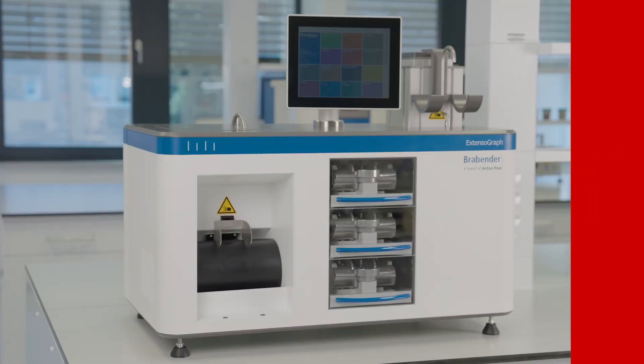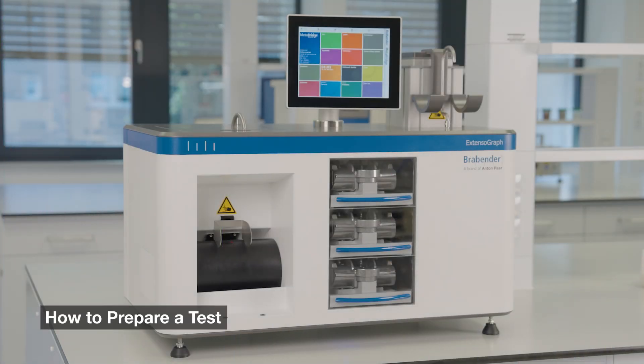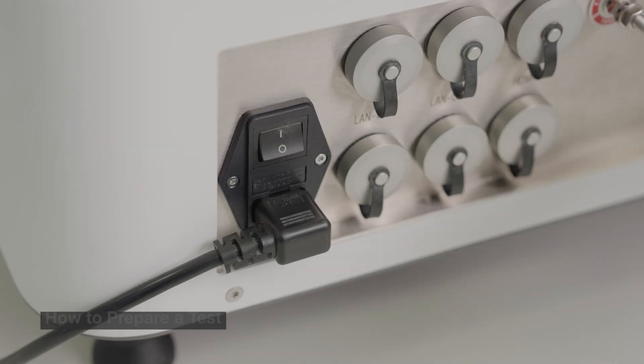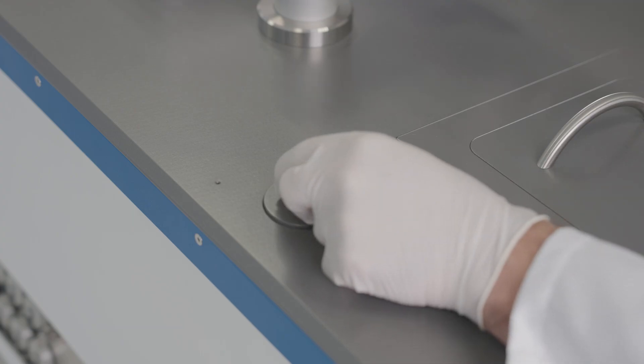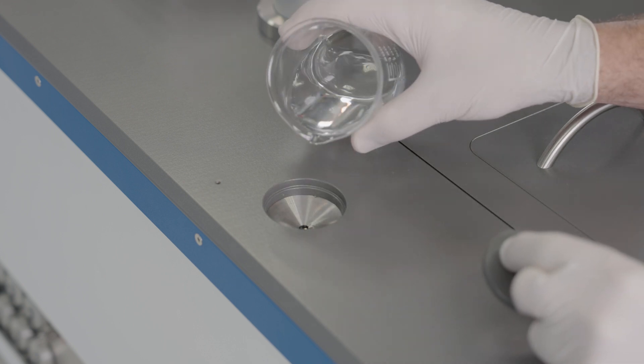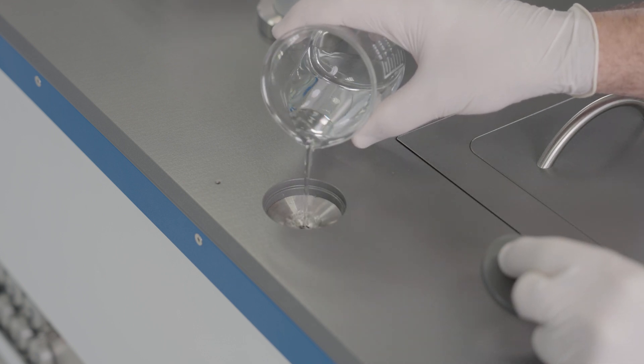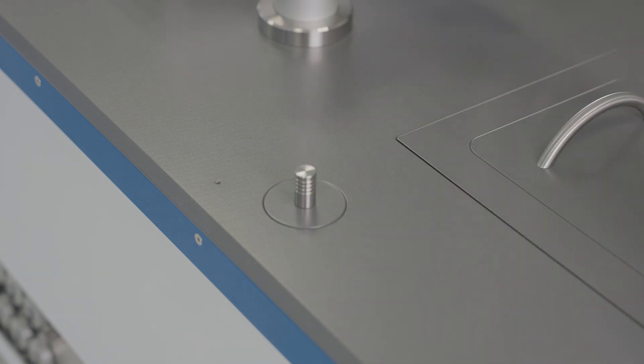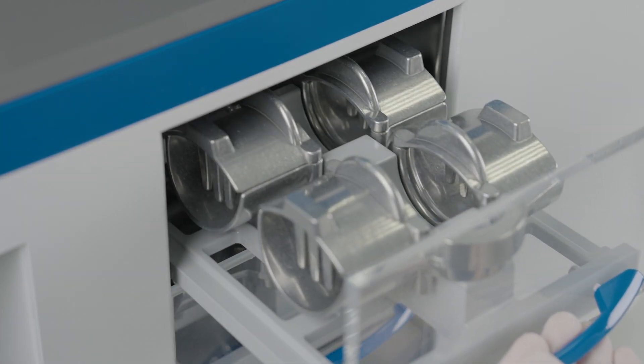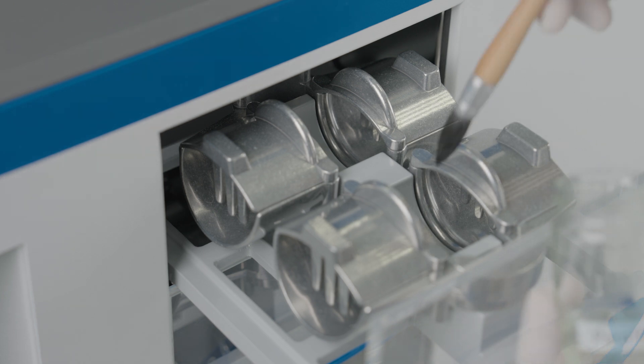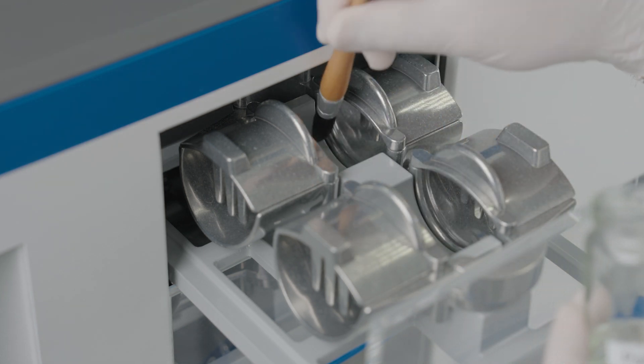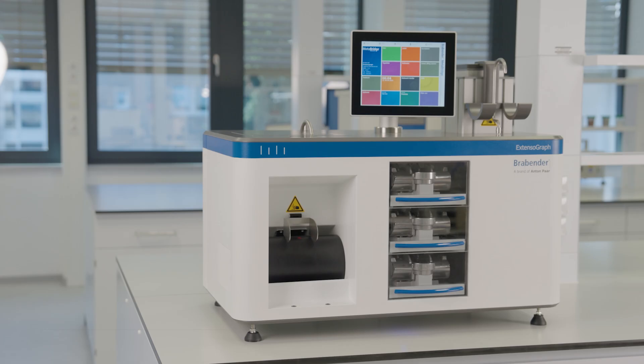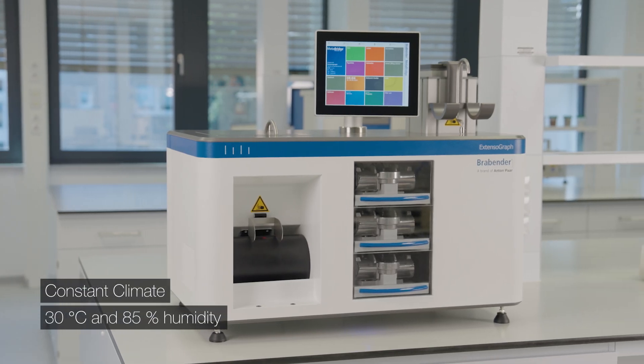In this quick start guide, we will show you how to set up and use the extensograph. Switch on the device and fill the water reservoir with 200 milliliters of water, then remount the lid. Open the tray and grease the tray supports with a thin film of paraffin oil daily to prevent dough from sticking. Close the tray and allow it to stand for 30 minutes to achieve a constant climate.